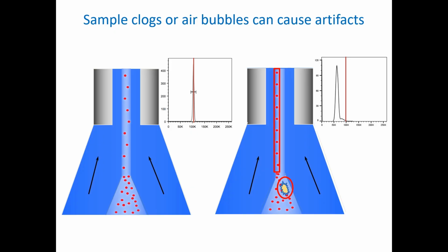This kind of issue can ruin a valuable experiment and can be avoided by good sample preparation and rigorous instrument cleaning and maintenance. Quality control beads should be run every day and whenever a problem is suspected.